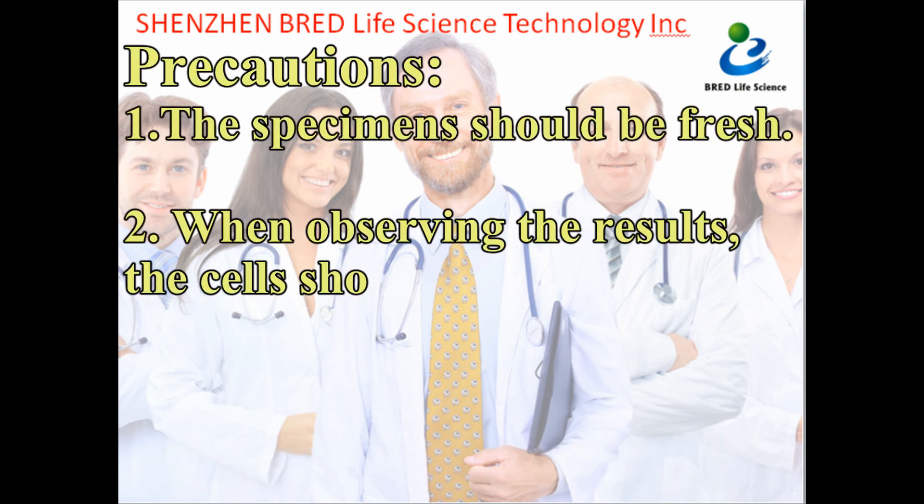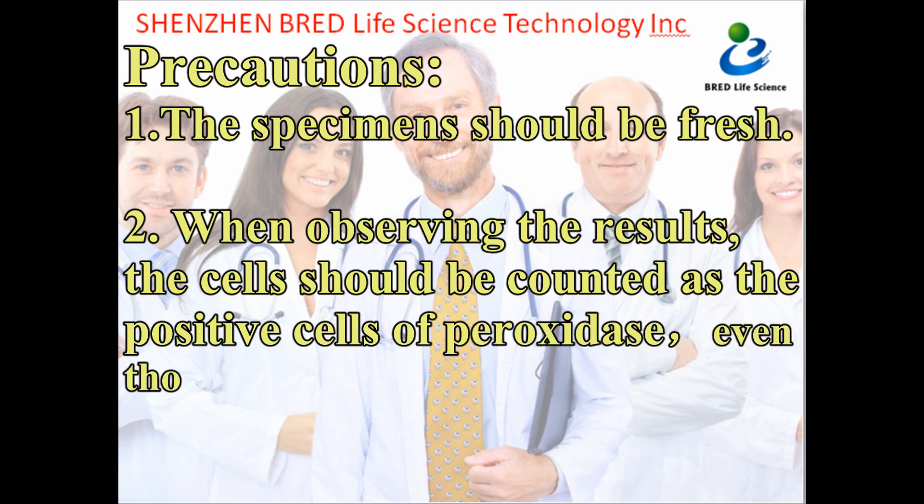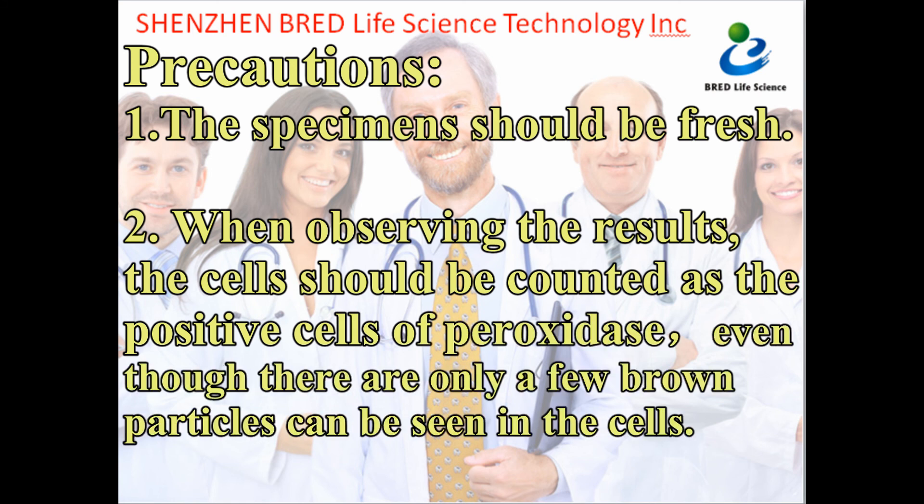Important notes: (1) The specimens should be fresh. (2) When observing the results, cells should be counted as positive cells for peroxidase even though there are only a few brown particles visible in the cell.